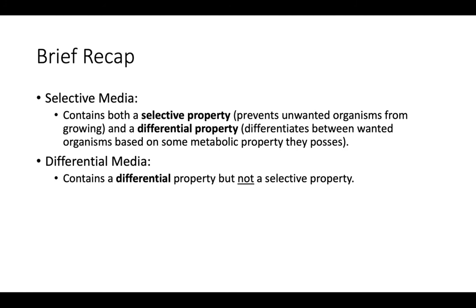So if you were selecting for MRSA, methicillin-resistant Staph aureus, you would put the antibiotic methicillin, or nowadays oxacillin, into the media, and only methicillin-resistant Staph aureus would grow. Those that are not resistant to that antibiotic would not grow, so you're selecting for resistant cells.